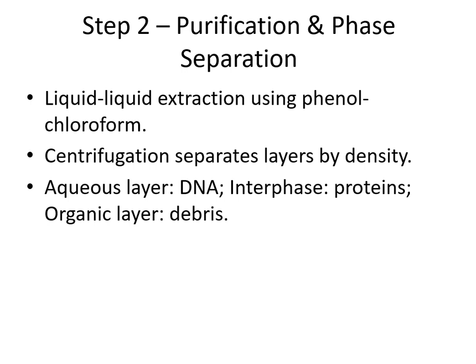On putting a phenol and chloroform mixture in the lysed sample, it is necessary to separate with centrifugation, which separates components based on their density. In the aqueous layer, there will be the DNA, in the interface there will be the protein, and the organic debris layer will be at the bottom of the centrifuge tube.